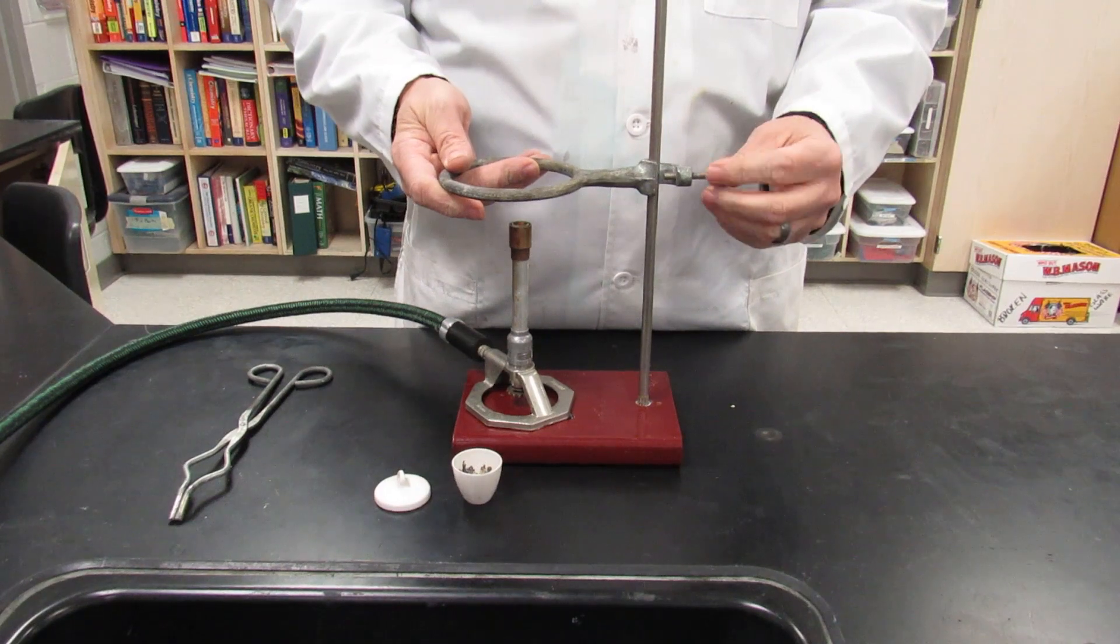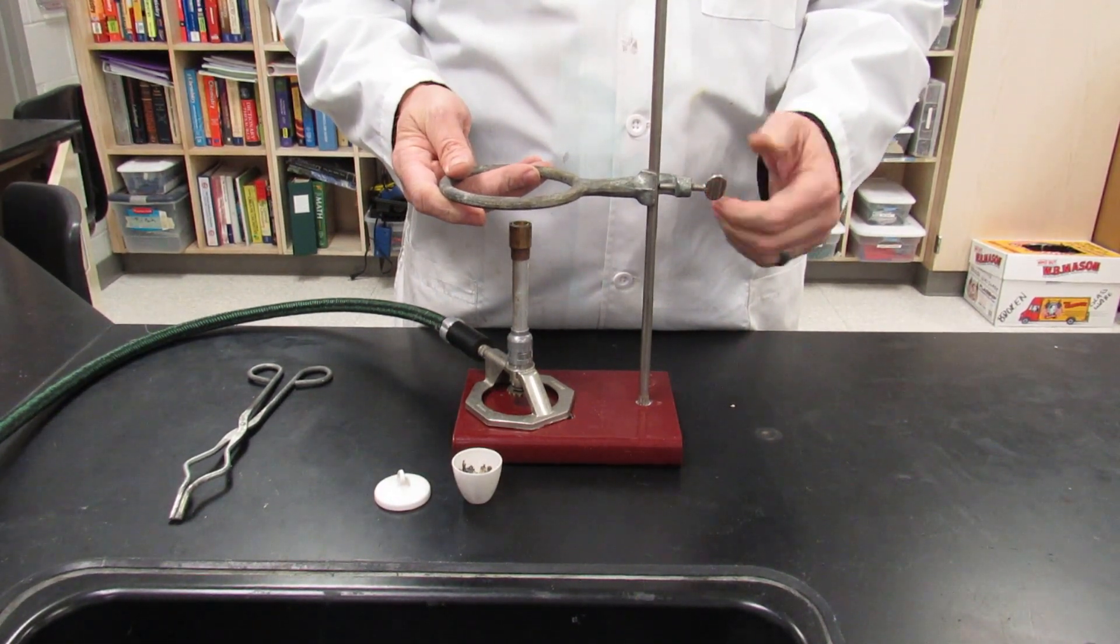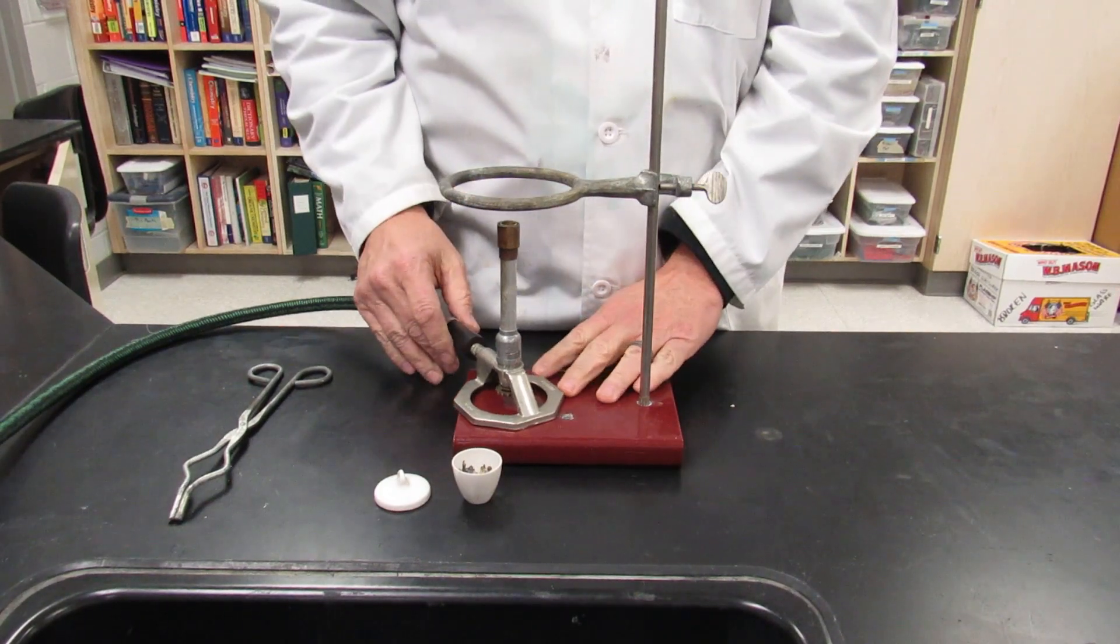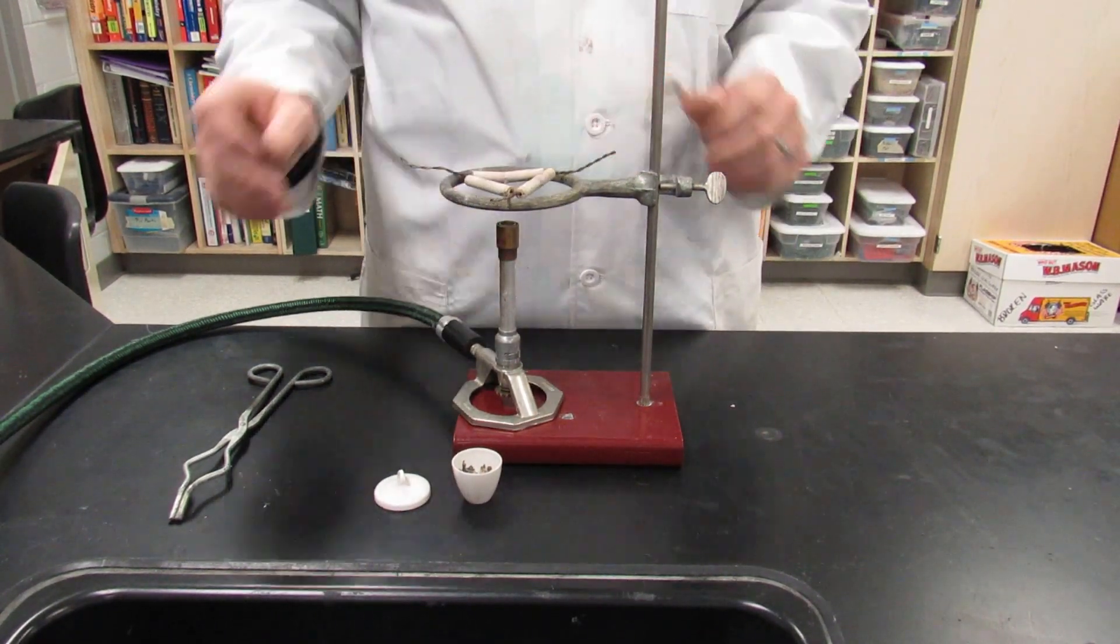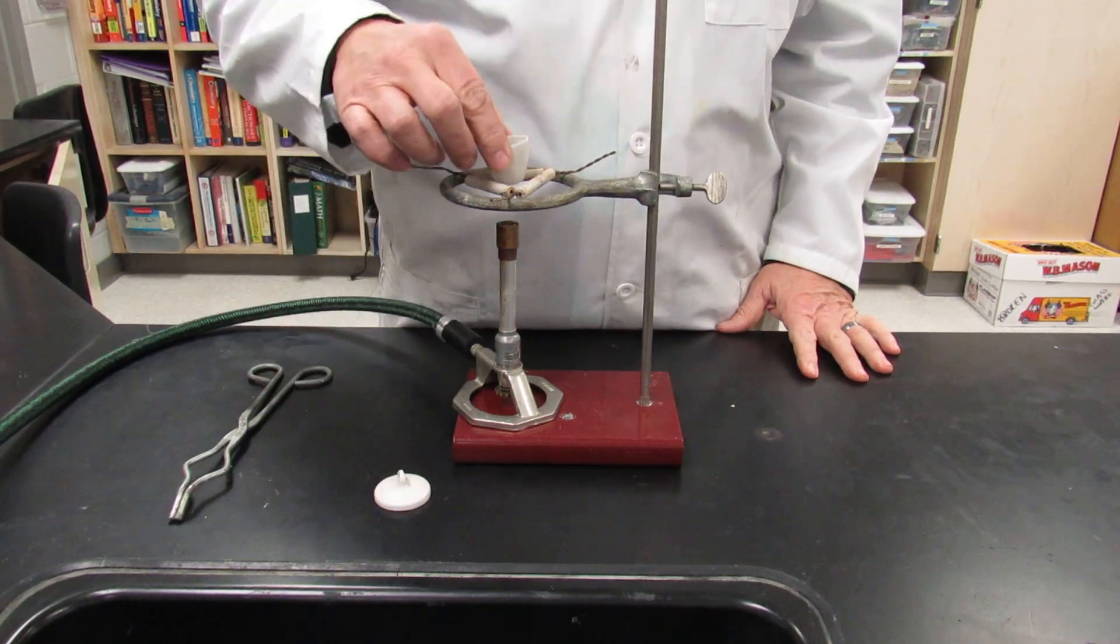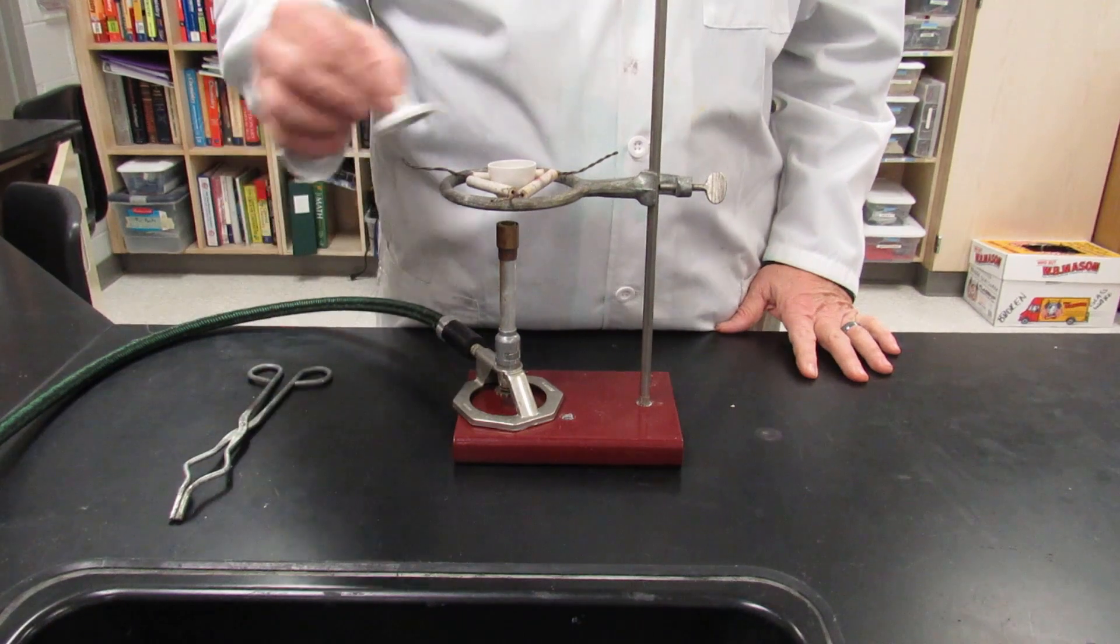This time you're going to be a little bit closer to the flame. You want to have a much more intense heat for this lab. You're going to add your clay triangle and then your crucible. Make sure your crucible doesn't fall through the hole in the triangle. And then put your lid on.